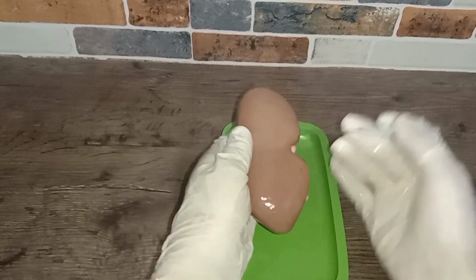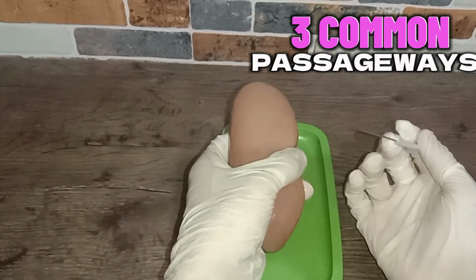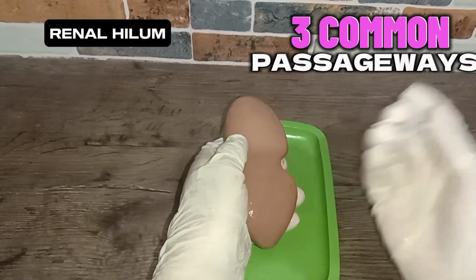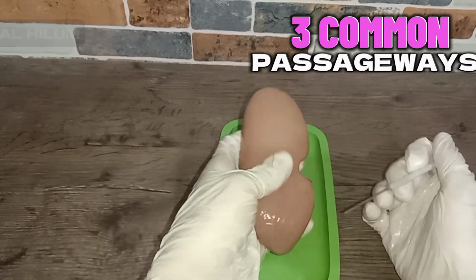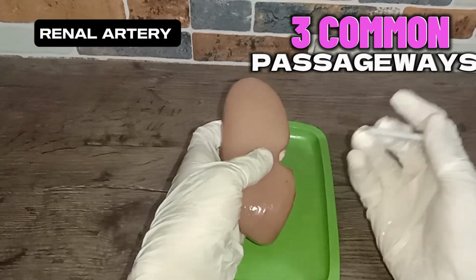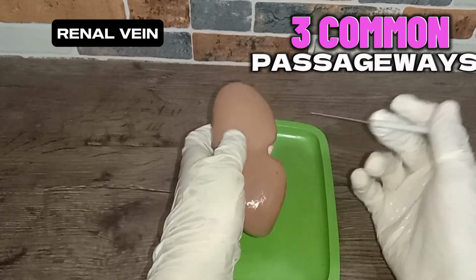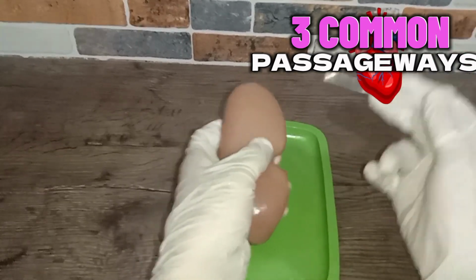Okay. We can also see here the three prominent passageways in this indented part of the kidney, which is called the renal hilum. Okay, so in addendum to that, the renal hilum is the entry and exit site for structures servicing the kidneys, like blood vessels, nerves, lymphatics, and the ureters. Okay, so going back, we have here the renal artery, right here. So the renal artery carries oxygenated blood from the heart into the kidney. Okay, so next we have the renal vein right here. So the renal vein carries the deoxygenated blood from the kidney into the heart, right?